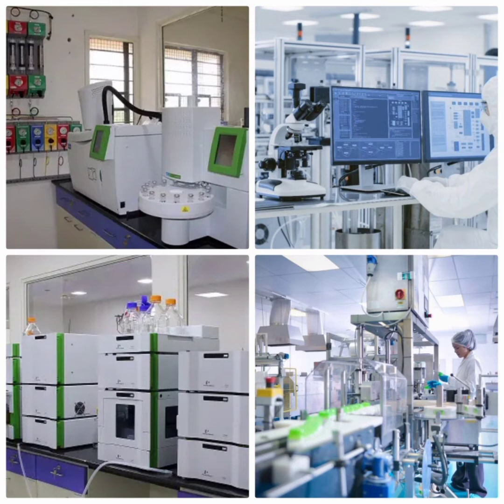Remark: Always keep in mind that both HPLC and GC are invaluable advancements in analytical instrumentation and indispensable in many scientific fields, but they are also susceptible to issues and limitations. Common problems are related to selectivity, sensitivity, and resolution, and these are affected by the nature of the sample, as we have said at the beginning.